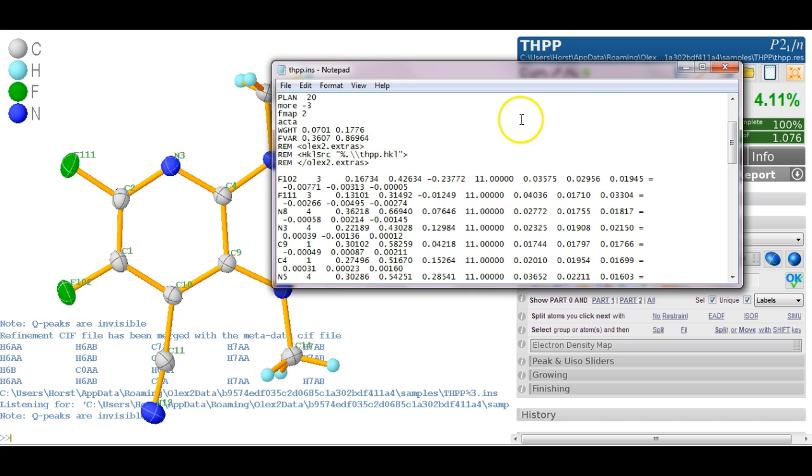So in a way you can use Olex 2 and if you wanted to edit a file which we really strongly discourage, but you can make modifications on this file every time you save it. Olex 2 will update and show you what happens. Now if you choose to edit INS file like this be aware we can't manage that. So if you make a mistake here then it just goes wrong, we have to reload that file and it breaks the flow.